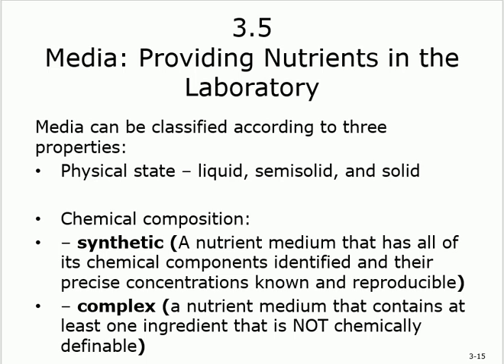So all of this, these are the steps to tell what this is. Okay? And we talked about, we said you put it in a nutrient medium, that's a special medium that we know will allow the growth of this organism. How about the nutrient itself or the medium itself?